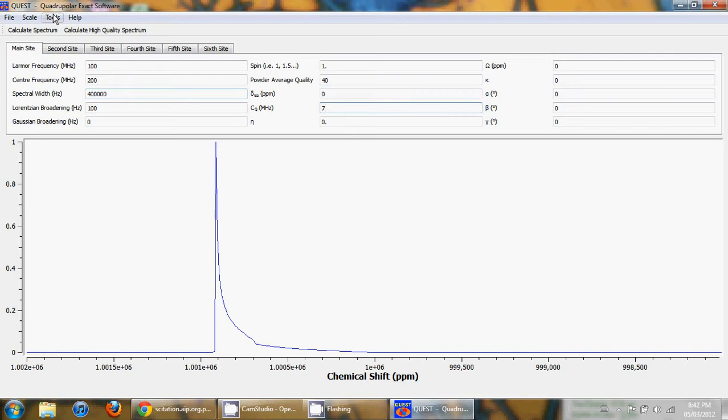The one thing that's very special for overtone transitions is that the intensity of the lines depends quite strongly on the orientation of your coil. So for this reason I added the option to change the coil angle. Typically the intensities are calculated as the square of the magnitude of the expectation value of the Sx operator. So this corresponds to a coil along the x-axis, and so for a coil at 90 degrees from the magnetic field.